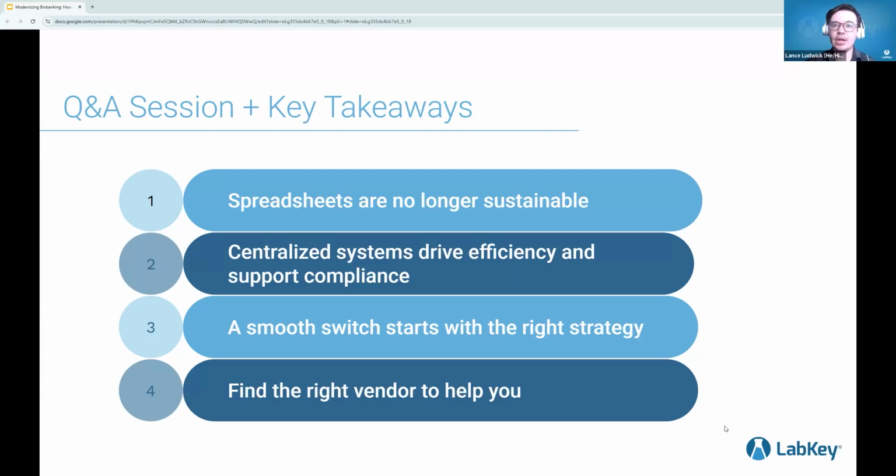We had another question. It looks like for setting up those lists of requirements, is there a specific form that they should fill out? So this definitely differs on each organization. One thing they'll do, they divide them into subtopics like, this is our data integrity, this is our IT specs, these are our sample requirements. This helps them organize their thoughts a bit better to fully explore each subject individually. And then they'll have questions underneath those subtopics.